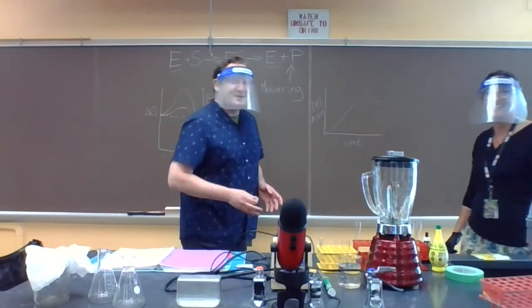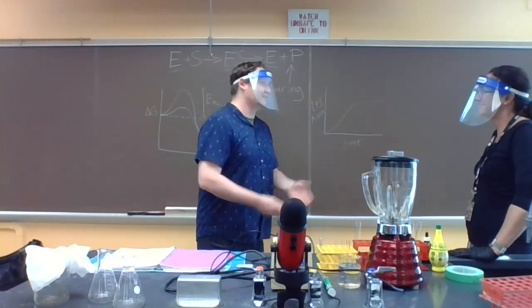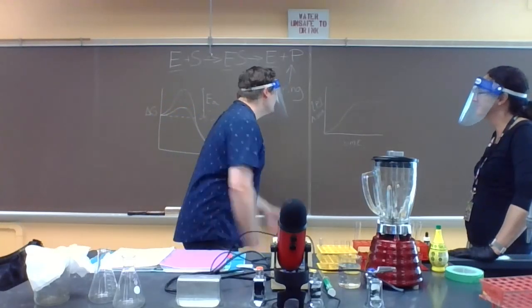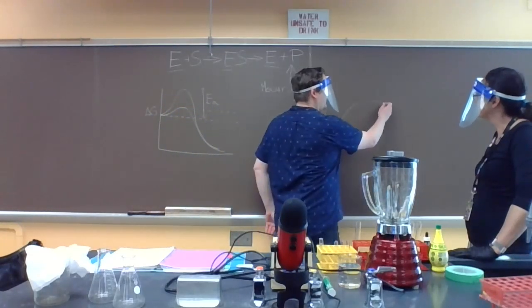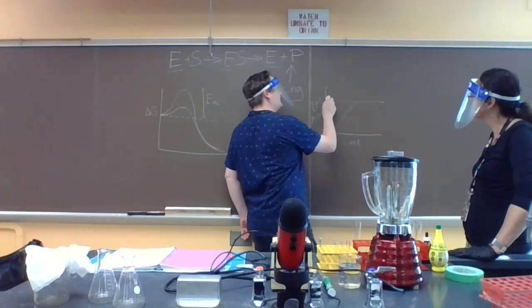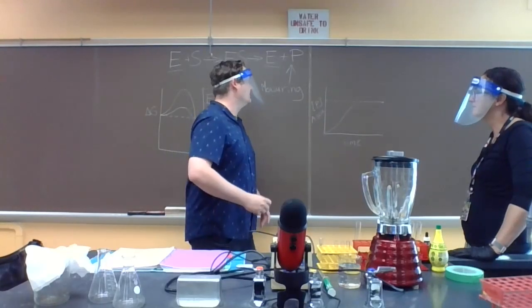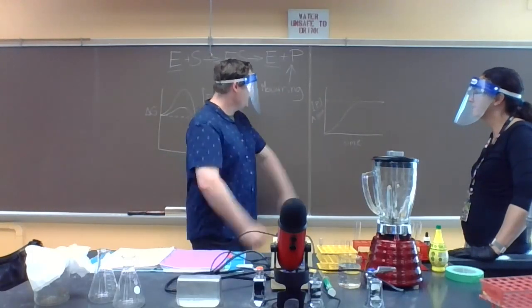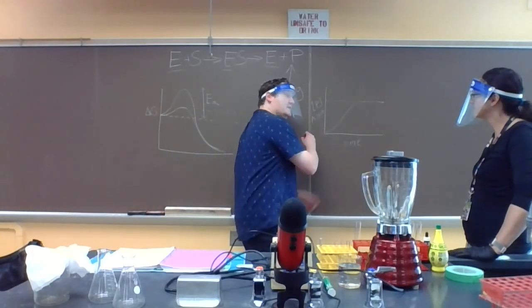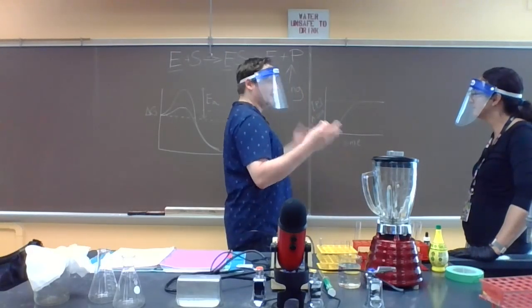So remember, we've got the same amount of substrate during the entire course of this first lab. So there's only so much product that can be produced. This would be the maximum amount of product that you can get, once every molecule of substrate is converted to a molecule of product. But if you have more enzyme, the interaction or encounter between enzyme and substrate is more likely.